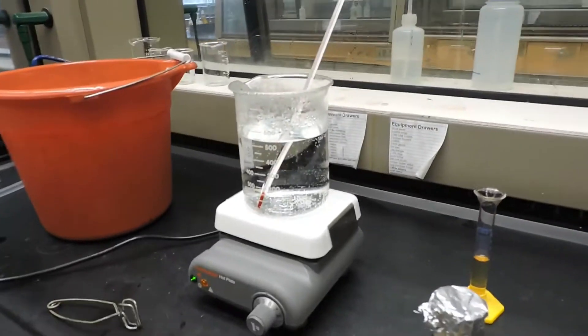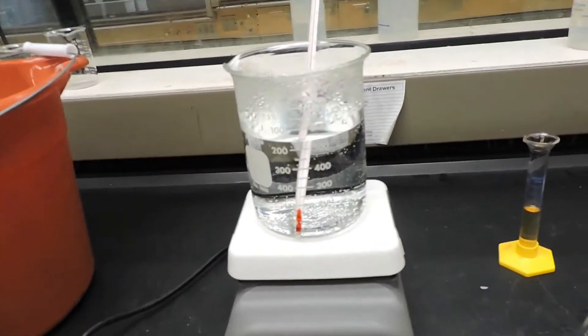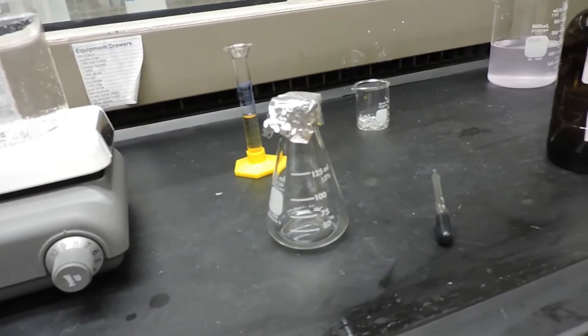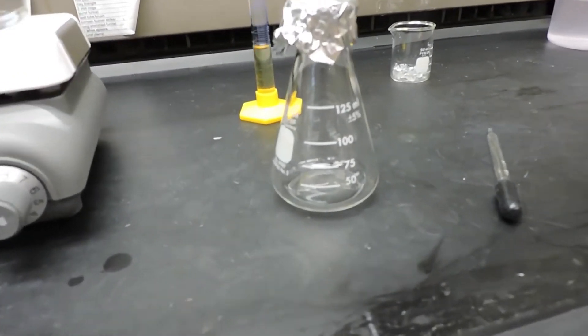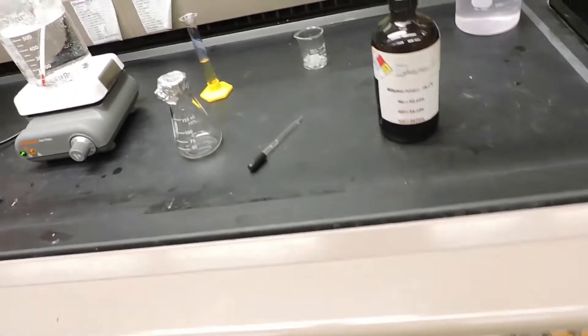Here we have a large beaker with around 550 milliliters of water heated up to approximately 90 degrees Celsius. We also have a 125 milliliter Erlenmeyer flask covered with a square piece of aluminum foil, and later we'll poke a hole in the top using one of these pens.